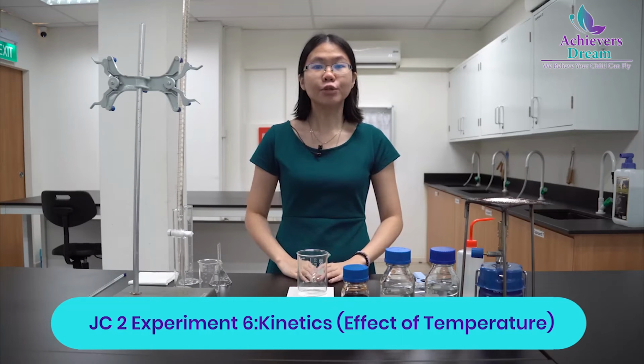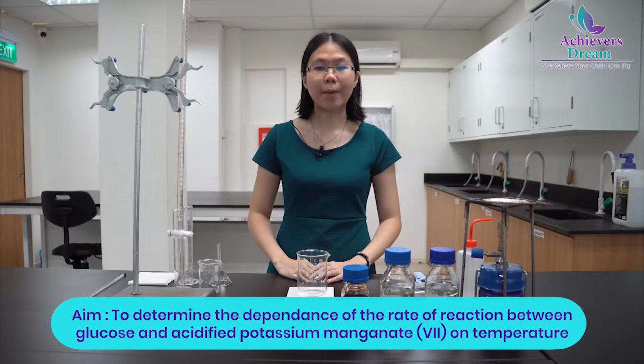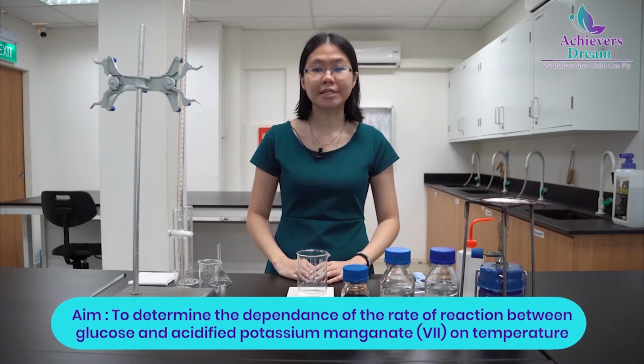Hello everyone, today we are going to do experiment 6, which is kinetic reaction to investigate the effect of temperature. So the aim of this experiment is to determine the dependence of the rate of reaction between glucose and acidified potassium manganate 7 on temperature.